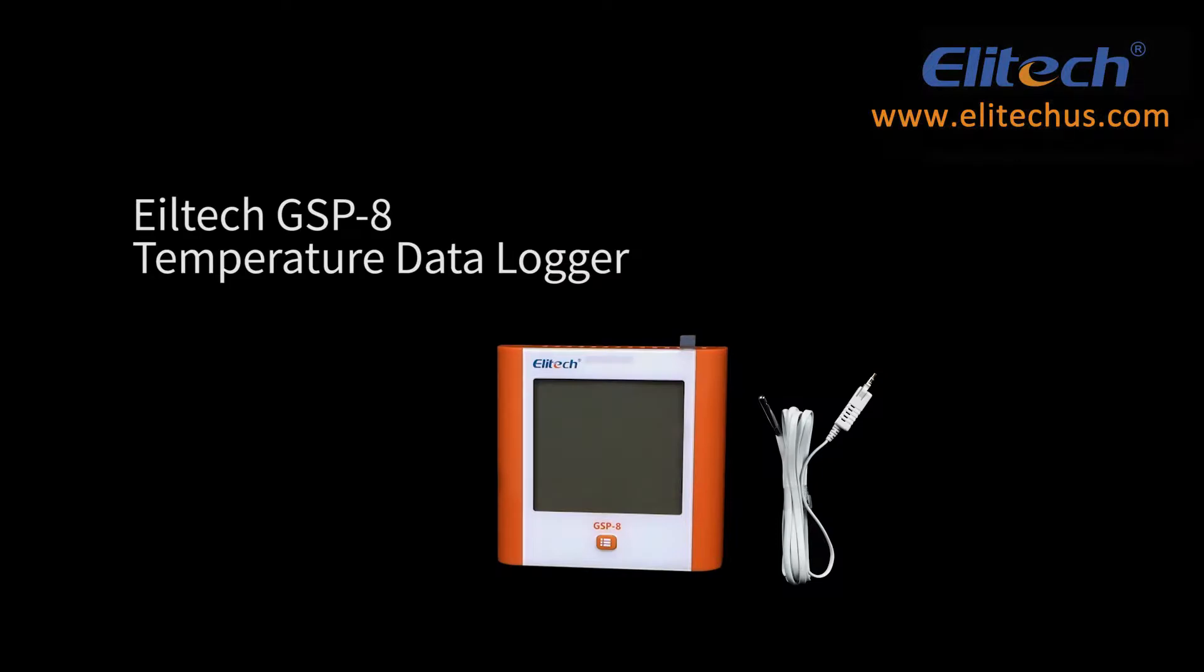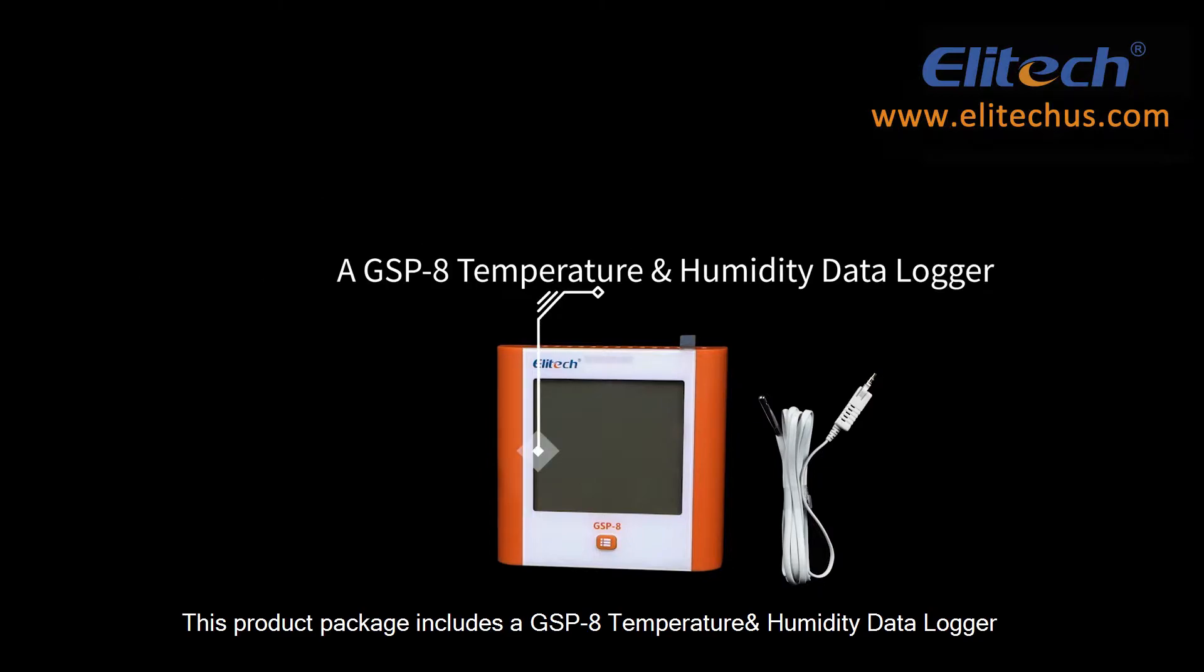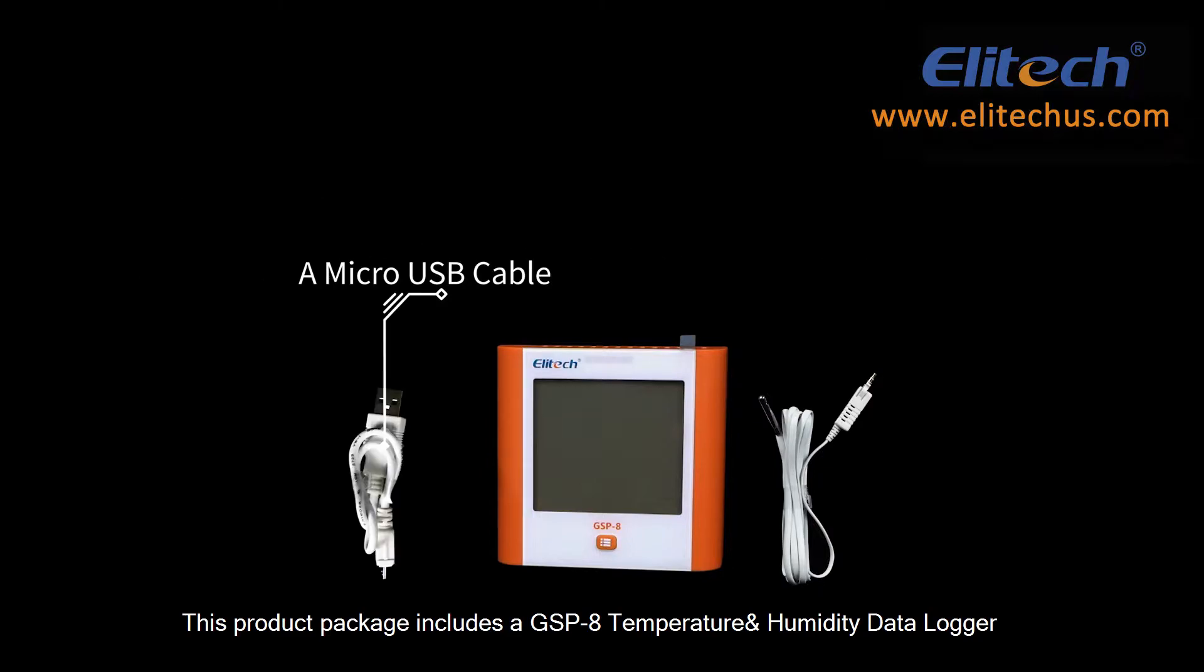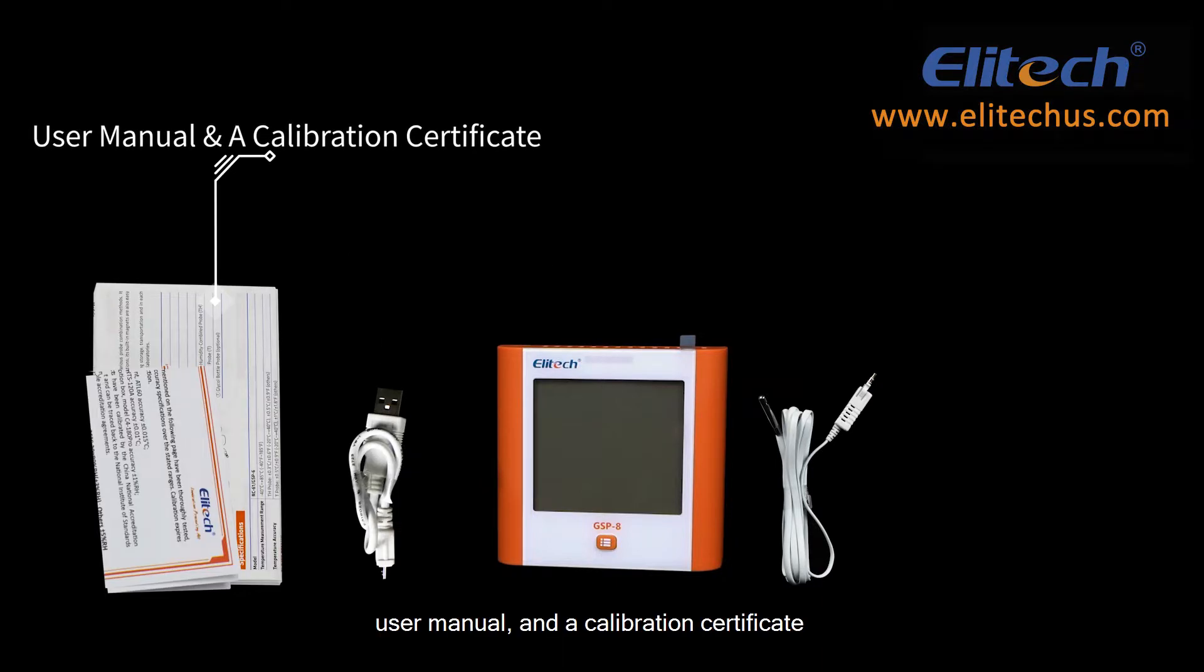The Elitech GSP8 Temperature Data Logger. This product package includes a GSP8 Temperature and Humidity Data Logger, a Micro USB Cable, User Manual, and a Calibration Certificate.